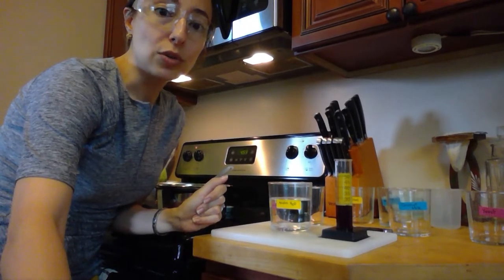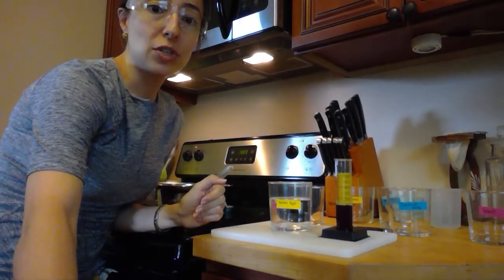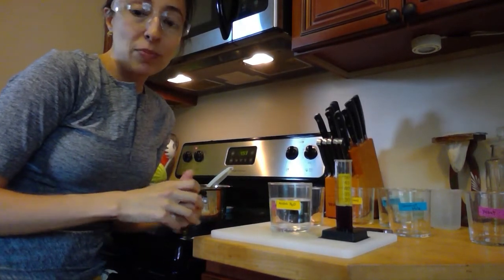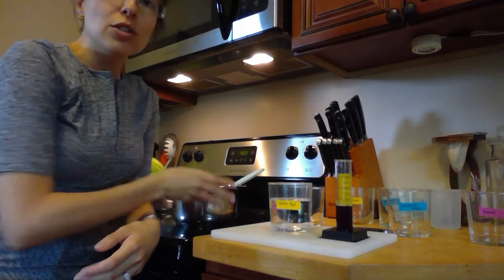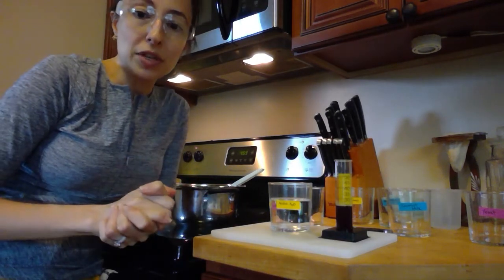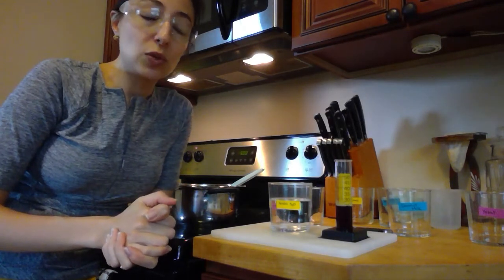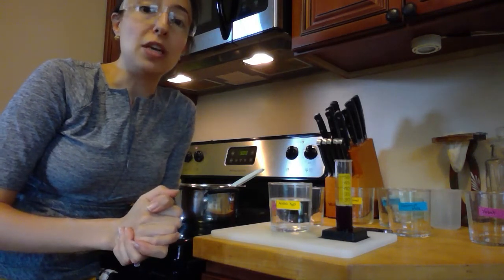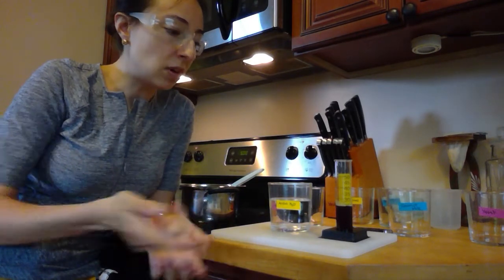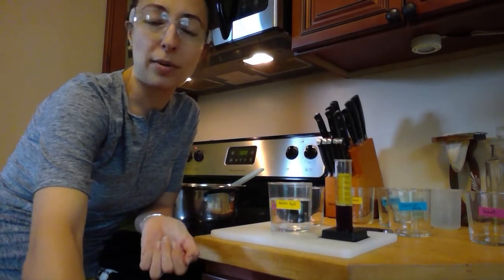So I'm going to go ahead and scroll down to number 4 on my procedure, and you'll see a nice table. You're going to fill in this table as you test out all of your different items. So it's going to ask you what the household chemical is. For this, it's acidic water. You want to predict the pH. So I'm going to guess that this is acidic. And then you'll write down what the actual pH is. Now, how do you know, right? All we have is this purple liquid. How do you know if it's acidic or basic with cabbage water?